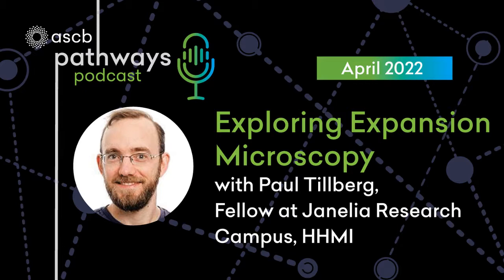The topology is preserved, even if something is a little bit less expanded than you would like it to be, like the nuclear pore. Yeah, I guess it depends on how much that matters, like you said, to what it is that you're studying.